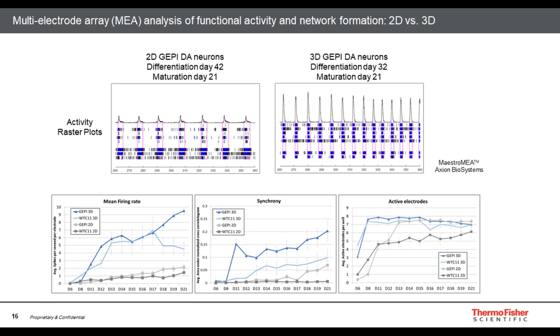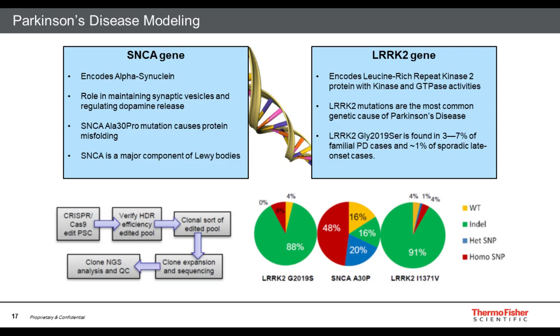So as you've seen, we have not yet recorded comparable activity within intact organoids. This may just be reality, or it may reflect poor contact between the organoids and the surface electrodes. Nevertheless, we have evidence that organoid culture promotes dopaminergic maturation. So I want to briefly discuss the possibilities of using midbrain organoids to model Parkinson's disease.